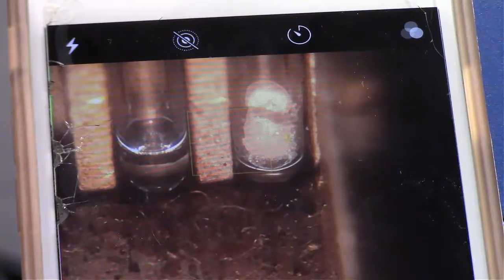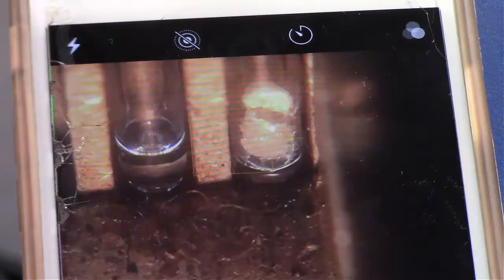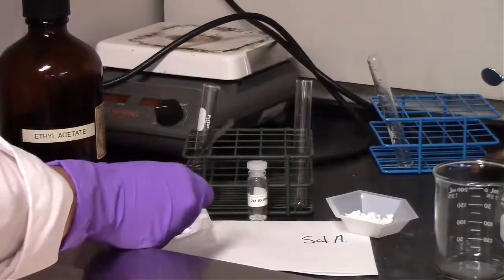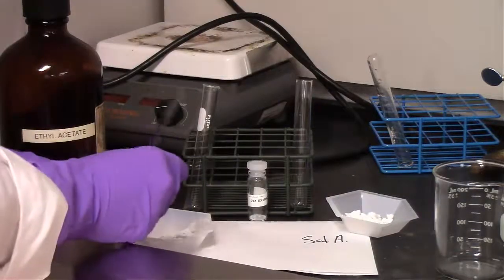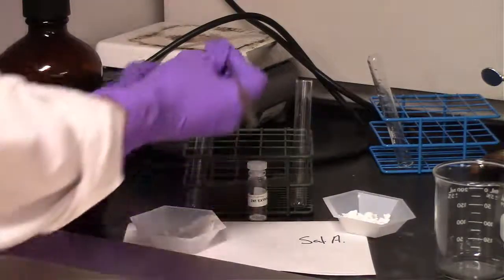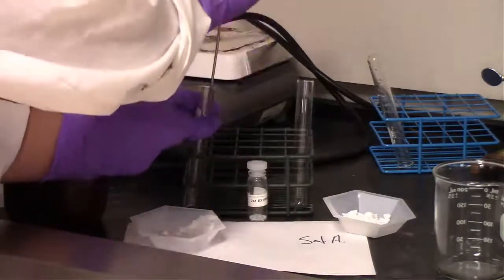You can't count that because it's not an equal representation as compared to our standard, because for our standard we don't have paper suspending additional solid. But you can still see some things are slowly melting off that paper. It seemed like it's very intertwined with that paper, so that's not too surprising. But we let the temperature keep going just to confirm and be sure that we did indeed have that paper there, and it looks like we did.